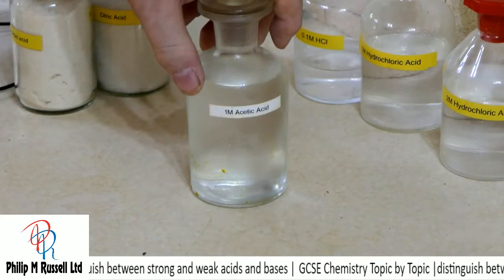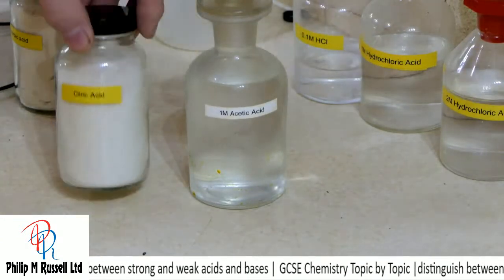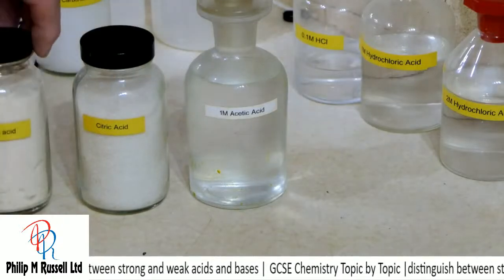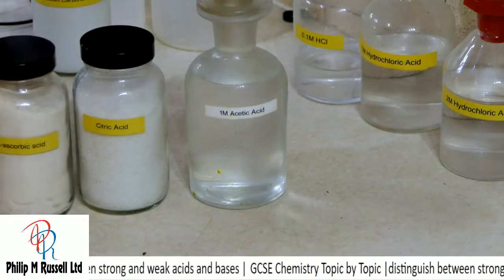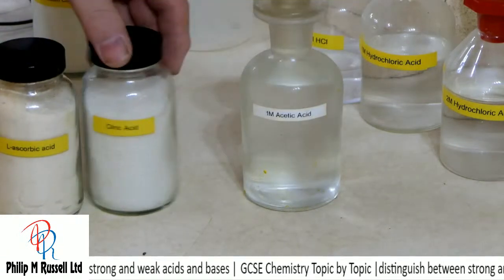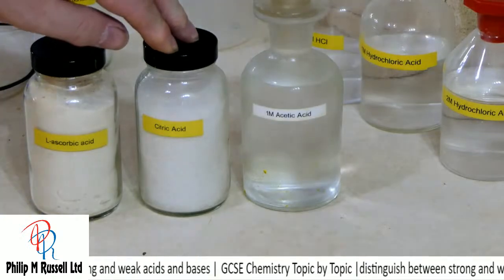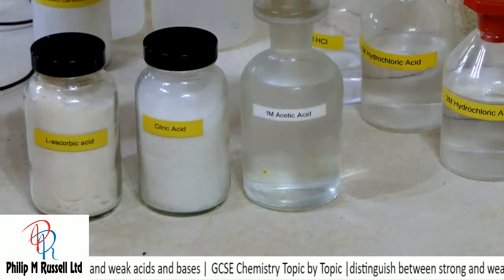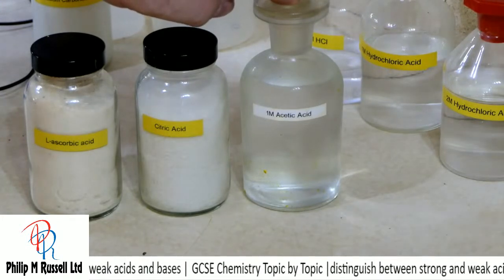I've got acetic acid, and some different acids here: ascorbic acid, otherwise known as vitamin C. Push them along a bit. Citric acid from citrus fruits, and acetic acid, which you probably know better as vinegar.